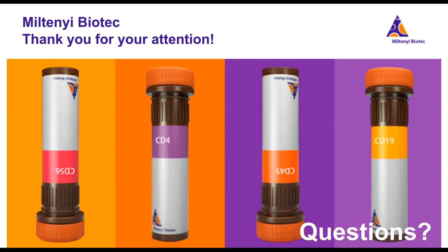Thanks for your question. So you mean saliva? Our antibodies, of course, are targeted for markers that are expressed mainly in certain cell populations. So if there are certain cell populations that you are interested in within a saliva sample, I mean, we haven't really tested with such a specific sample type, but I believe if there are cell types that exist for which we have markers, it may work.